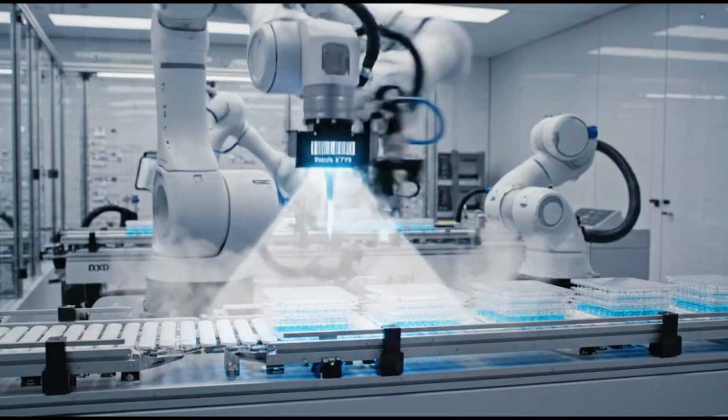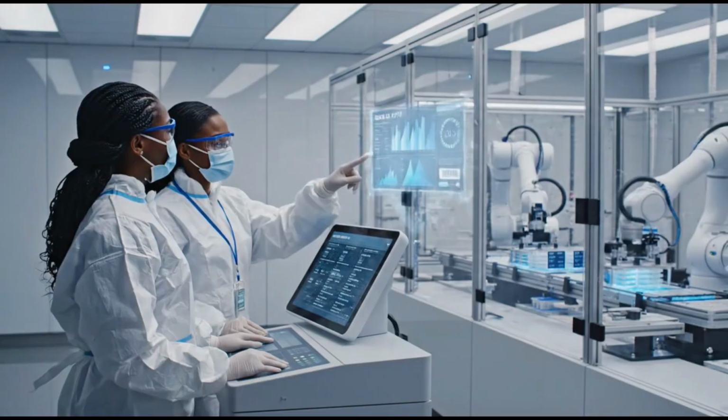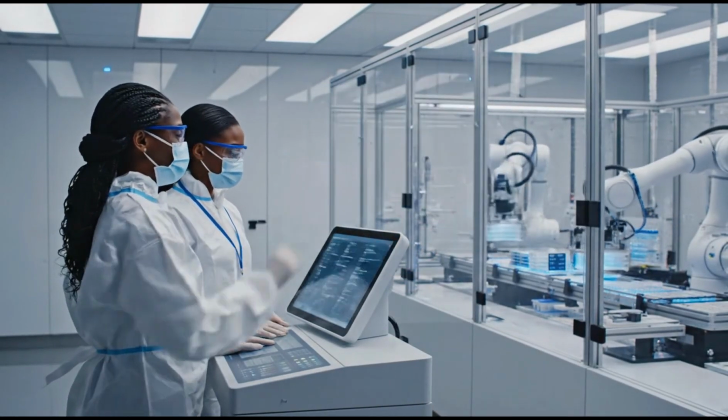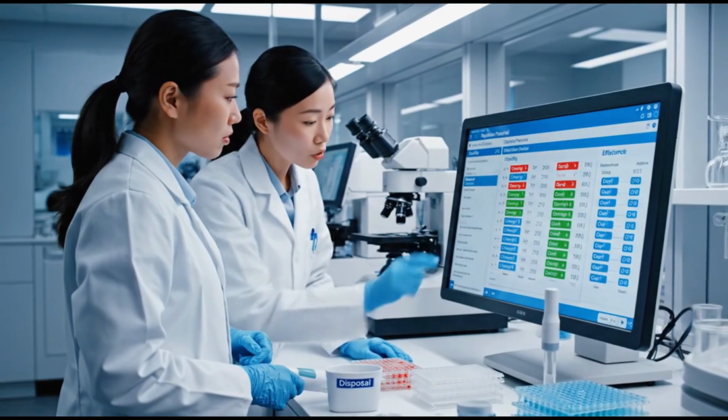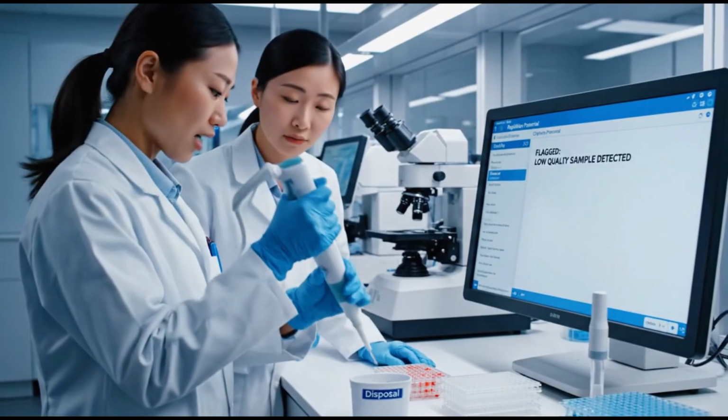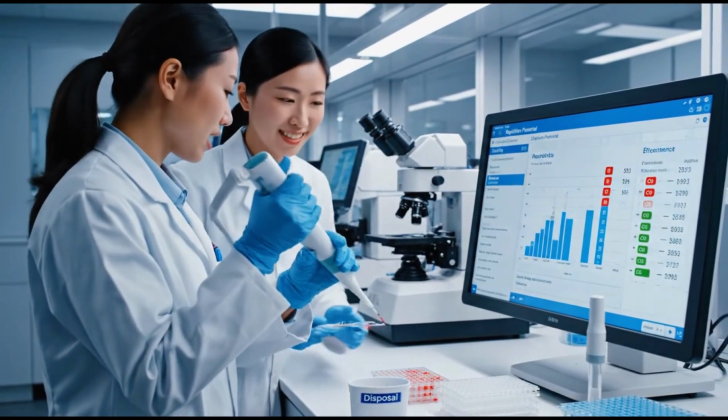We are verifying batch X7Y9. All parameters are within acceptable limits. Data confirmed. Approved for incubation. The replication potential looks good, but the efficiency markers are unstable here. Yes, the software flagged it. We need to remove that sample immediately.